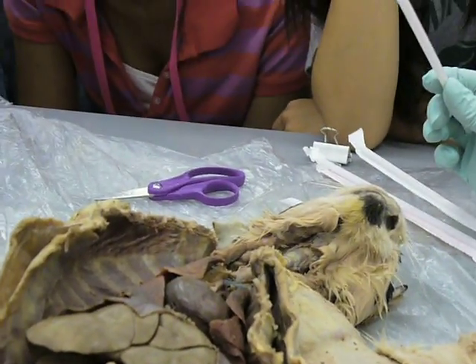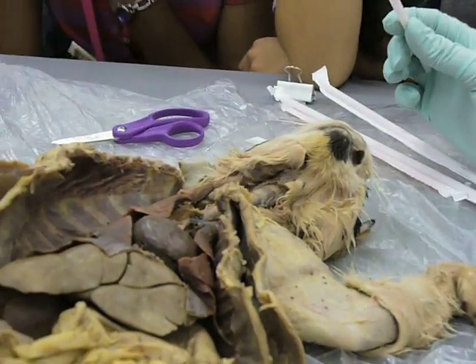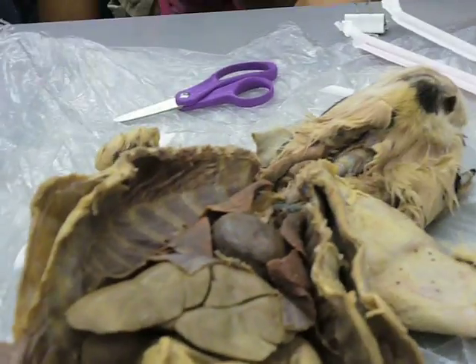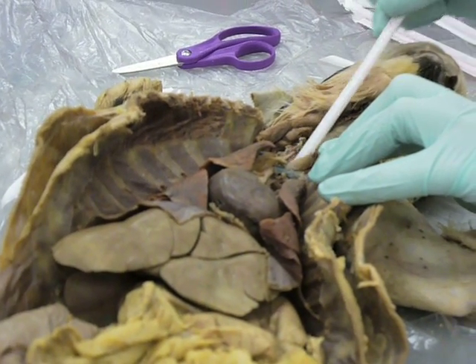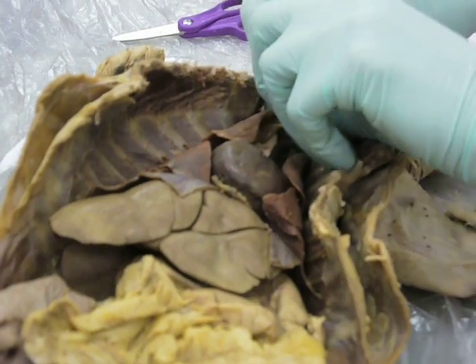You would cut between the tracheal cartilages that are really prominent up here. You can kind of find the place where there's a dent that your finger fits into really easily — that's where you'd cut the hole. Then you would stick a tube, a straw, or in an emergency situation, take the ink cartridge out of a pen and use that.